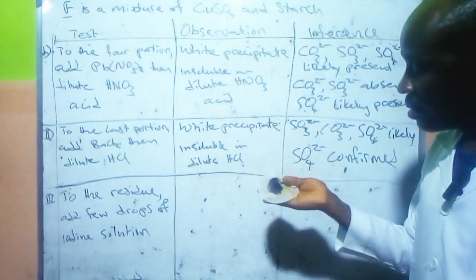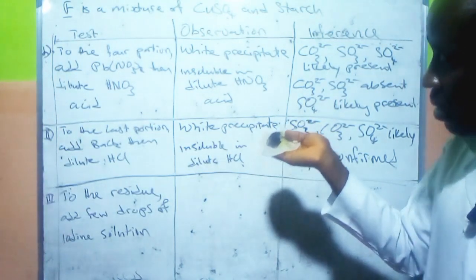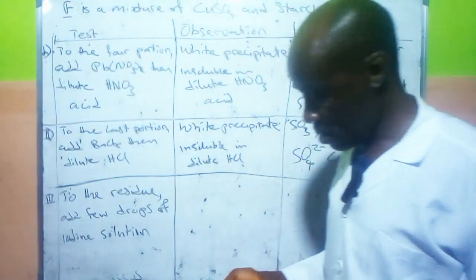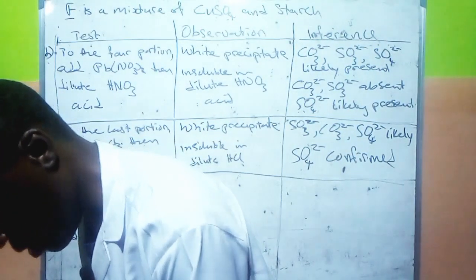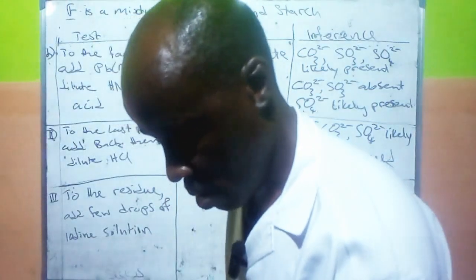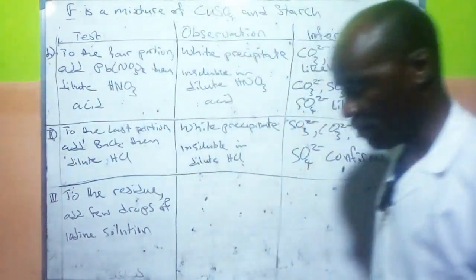In fact, this is more like black only. You can see the color of the residue. That means it's only starch that can give us this kind of test.